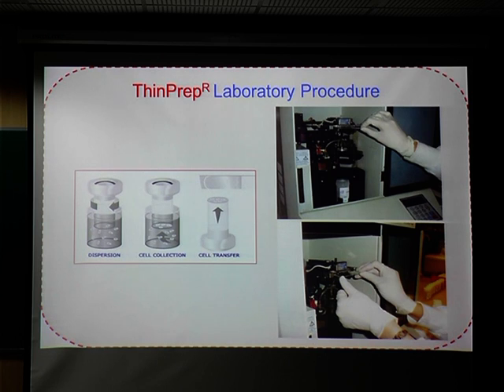Now the second preparation is the ThinPrep procedure for making liquid based smears. Now what is done in this, again there is dispersion of the cells by spinning the cells. Here you have a vial and you have a cylinder too. At the base of the cylinder you have a filter membrane. So it is a membrane based technology. Now after the vial or the material is spinned and the loose clusters are separated, a vacuum is applied to this, and the cells start depositing on the membrane.